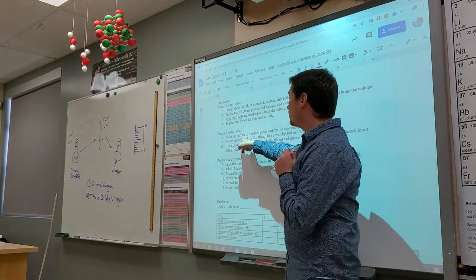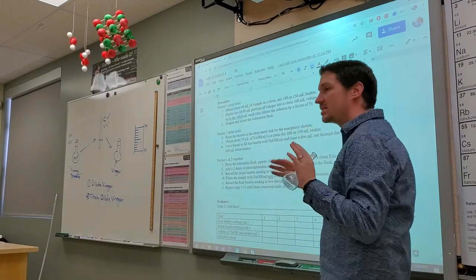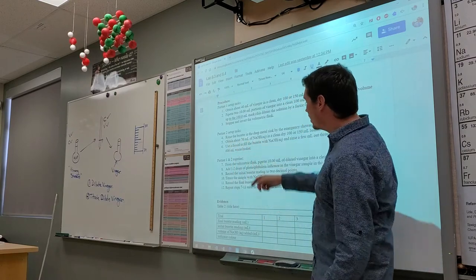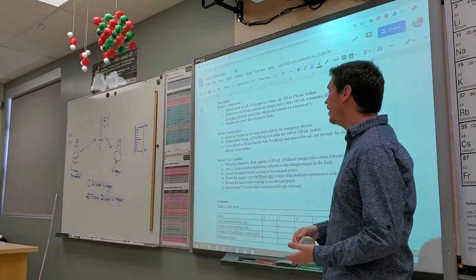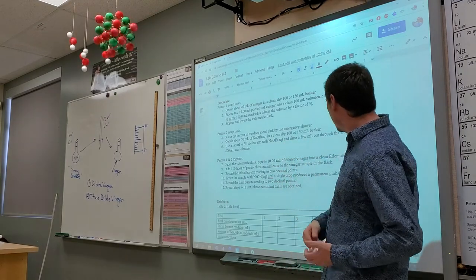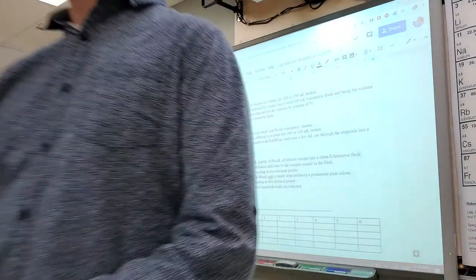Partner number two is going to be setting up the burette. You don't have to rinse the burette in the deep metal sink unless it's really super dirty. Obtain 70 milliliters of sodium hydroxide, use a funnel to fill the burette, and rinse a few milliliters through the stopcock.